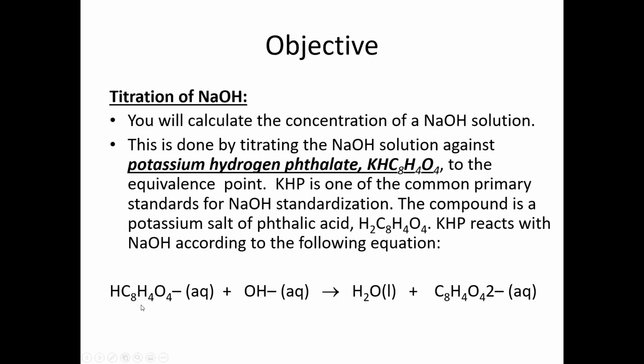The hydrogen phthalate anion reacts with hydroxide anion and forms water and the phthalate anion. So 1 mole of KHP reacts with 1 mole of sodium hydroxide.